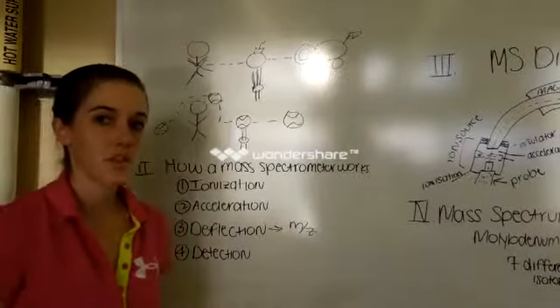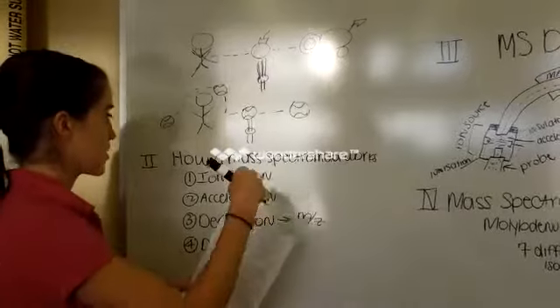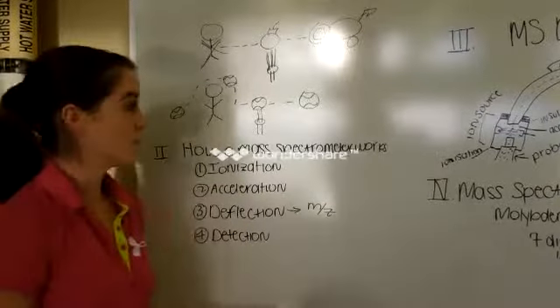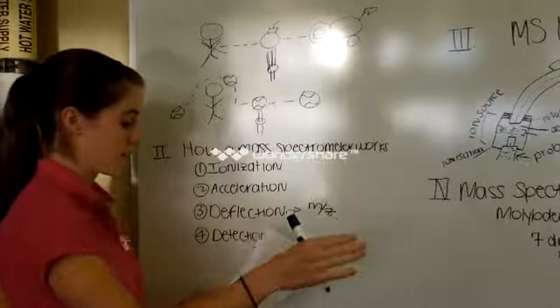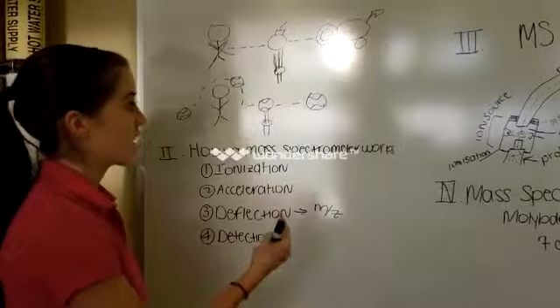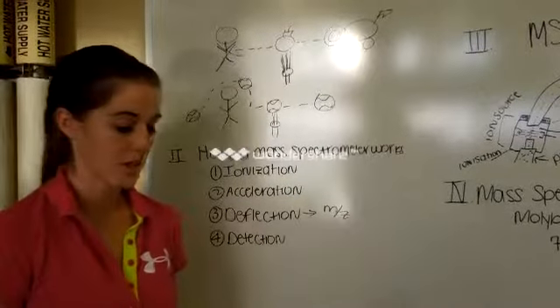So the amount of deflection you get for a given sideways force depends on the mass of the ball. If you know the speed of the ball and the size of the force, you could then detect the mass of the ball if you knew the amount of deflection that it took along some pathway. The less deflection, the heavier the ball, and vice versa. So you can apply this exact same principle to atomic-sized particles, and that's basically what happens in mass spectrometry.